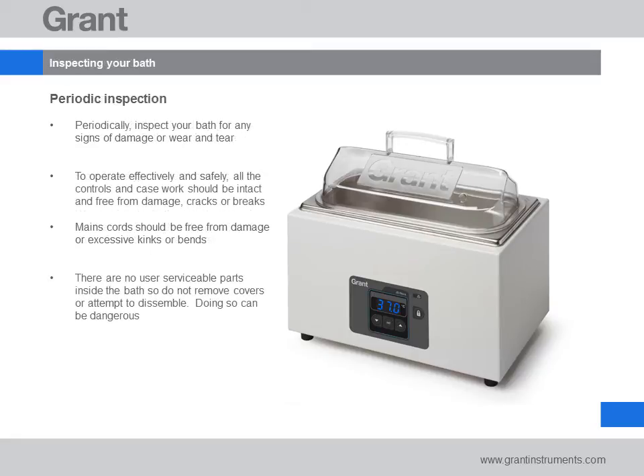There are no user serviceable parts on the water bath so removal of covers will never be necessary. We do suggest that you periodically check the water bath for any obvious signs of wear and tear. For safe and effective operation, the water bath should be free from cracks or damage and the power cord free from kinks or bends.